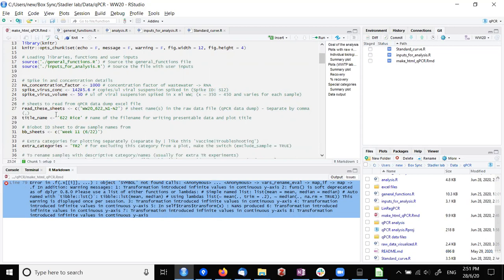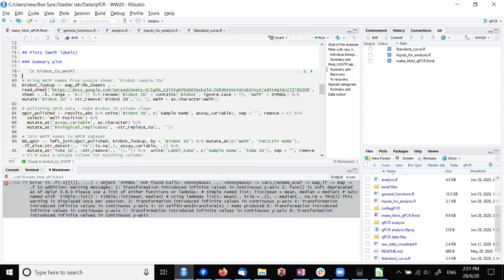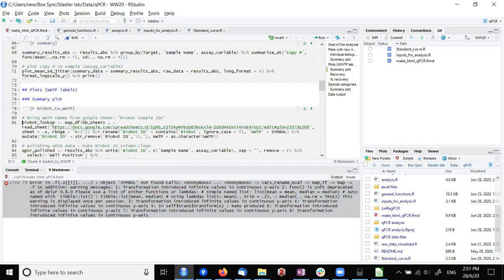Yeah, so it says line 79, there's an error. So you go hunt for it. Let's see in 2 minutes if you can find the error. Otherwise, that's the overview, it's almost done.